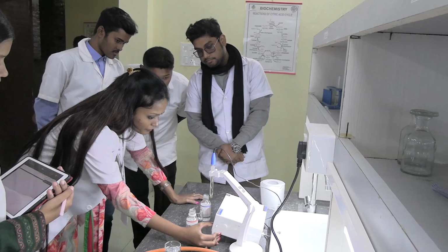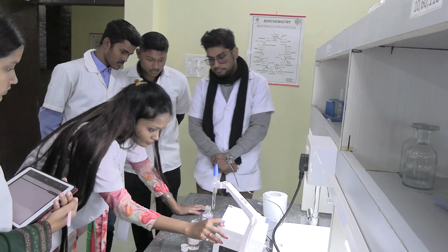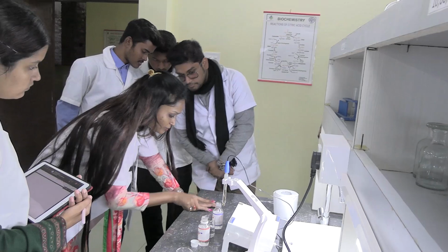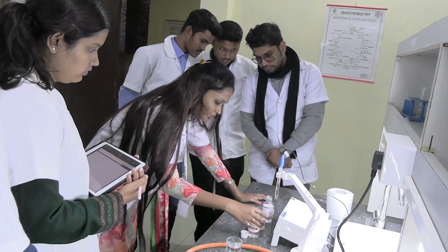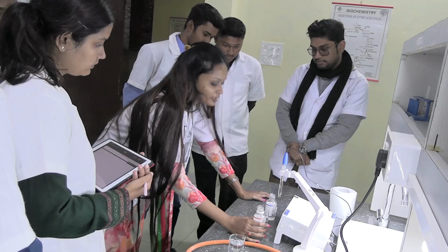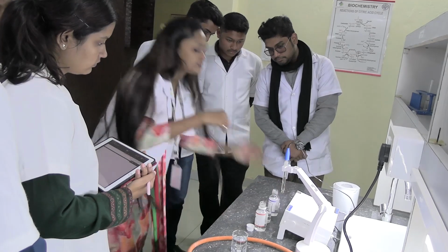First we have to set pH mode because we are measuring pH. Now there are 2 buffers. One is pH buffer 7, the neutral pH buffer. Another is pH buffer solution 4, the acidic pH buffer. So there are 2 set buttons, set 7 pH and set 4 pH.